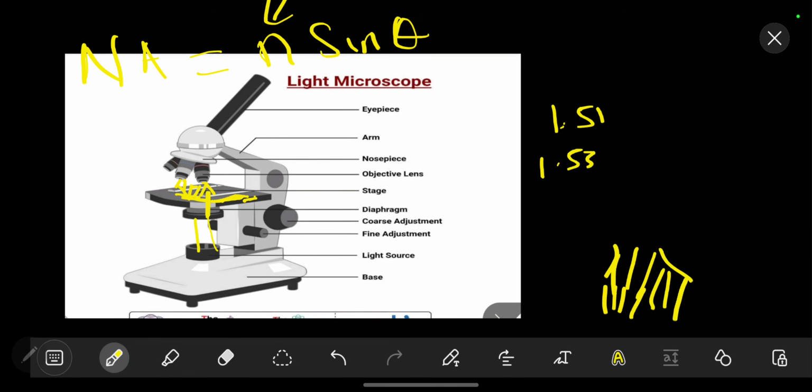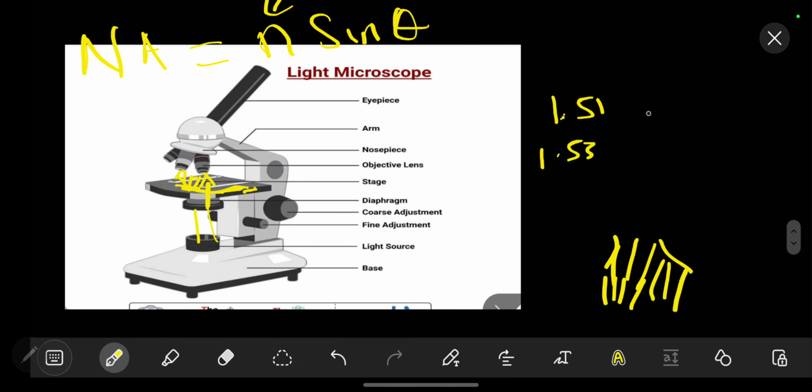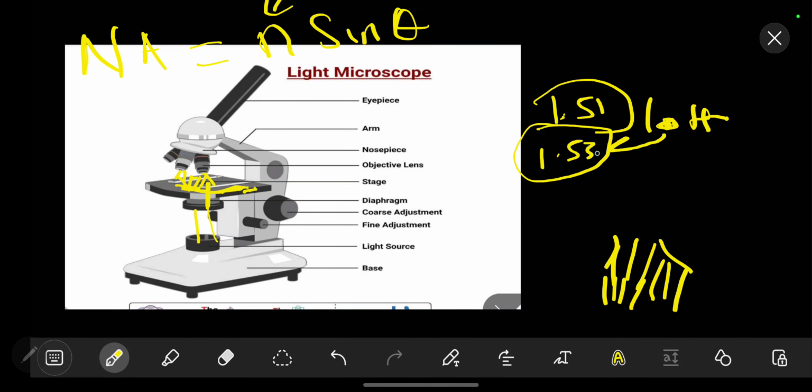So sometimes some other books will tell you that the numerical aperture is 1.4, which is one of the recommended values. So in other words, glass might be somewhere around this, but all in all, you can just realize that 1.4 is very close to this. So this is for glass, glass may take these values, and the numerical aperture of the oil might be this.